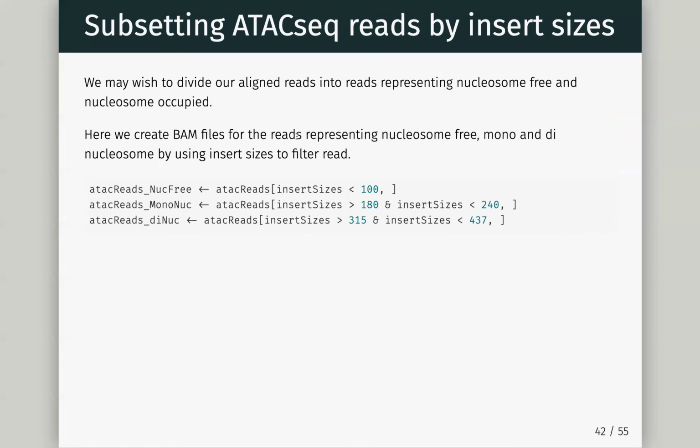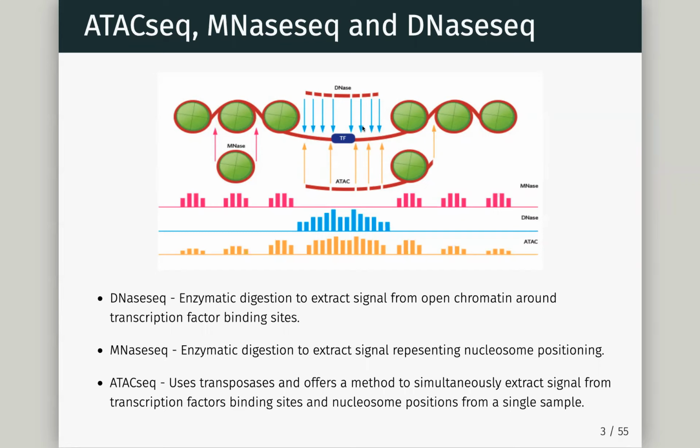But there still could be, for whatever reason, you managed to collect a fragment which didn't chop anywhere, and you managed to sequence that. The idea is that by getting the transposase concentration right, you're going to break up your DNA in a reasonably efficient manner. If you really lowered that, you would get no breaking up, and then you would end up with really long fragments. Quite common is that people over-transposase their data.